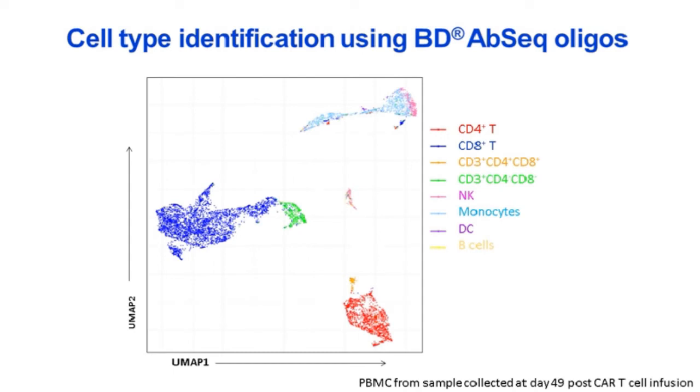As a first example, let me introduce you to this classical way of representing high dimensional data. You probably have come across these dimensionality reduction plots if you are interested in single cell technology. This, in this case, is a UMAP plot, very similar to a t-SNE plot or a principal component analysis plot. So effectively, we are reducing the complexity of each cell to 2 dimensions. Each dot in this plot is a cell, and as you can see, in these 2 dimensions, we are able to characterize different types of cells.